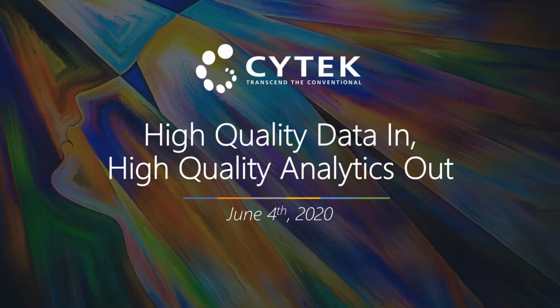Thank you so much, Janelle, for the kind introduction, and also thank you everyone for attending this cool initiative. Current innovations in reagents and instrumentation allow for the measurement of unprecedented number of simultaneous parameters for thousands of individual cells in each sample analyzed. And there is a clear need for robust data analysis tools to explore those data sets and understand their complexity.